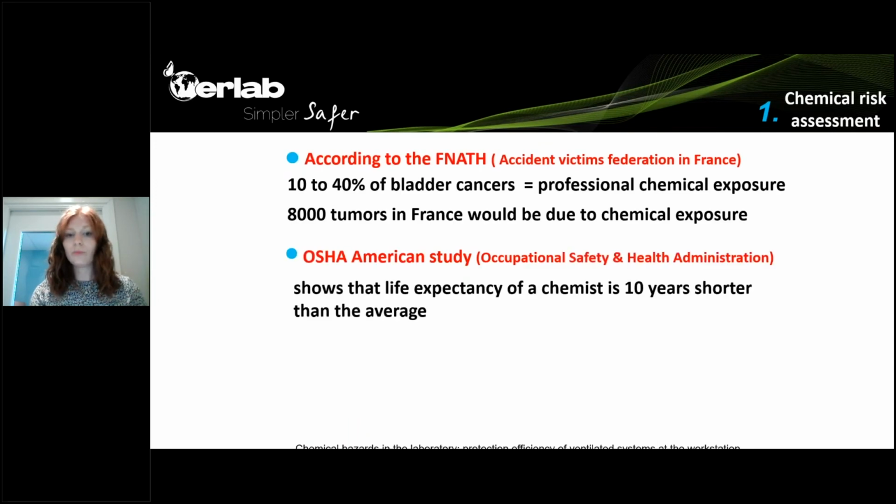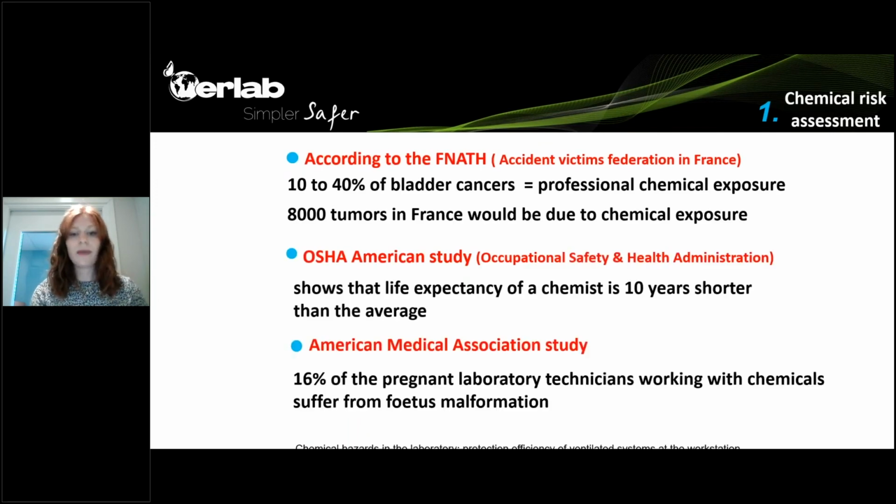So there are some studies that have been made in the past that show that, for instance, 16% of the pregnant laboratory technicians can suffer from fetus malformation, according to the American Medical Association study. That is to really realize that there's risk in the laboratory and they need to be assessed.